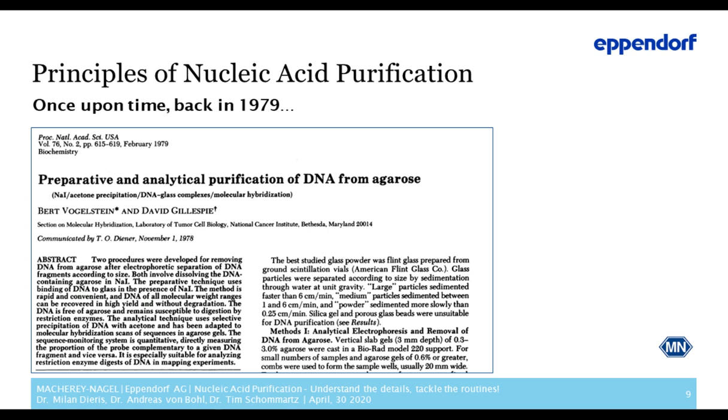If we look a little bit back into history, into the late 1970s, people were already using nucleic acids for a wide range of applications. These applications might be simpler or less complex than today's, but still, at that time, this was the state of the art. PCR was not invented until the early 80s. Sanger sequencing was not commercially available yet, so all of these things were not there yet in the lab.